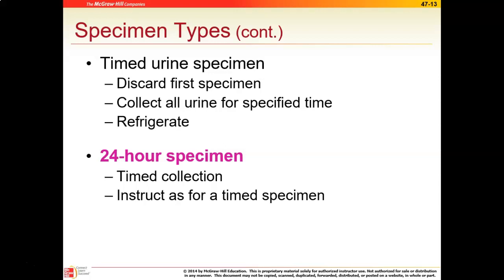You're always going to start with emptying your bladder first into the toilet, and then that will be your start time. Okay. Those 24-hour specimens usually come with a little bit of powder or liquid preservative in it, so it'd be very important to make sure that the patients know that that's normal and to not discard it.